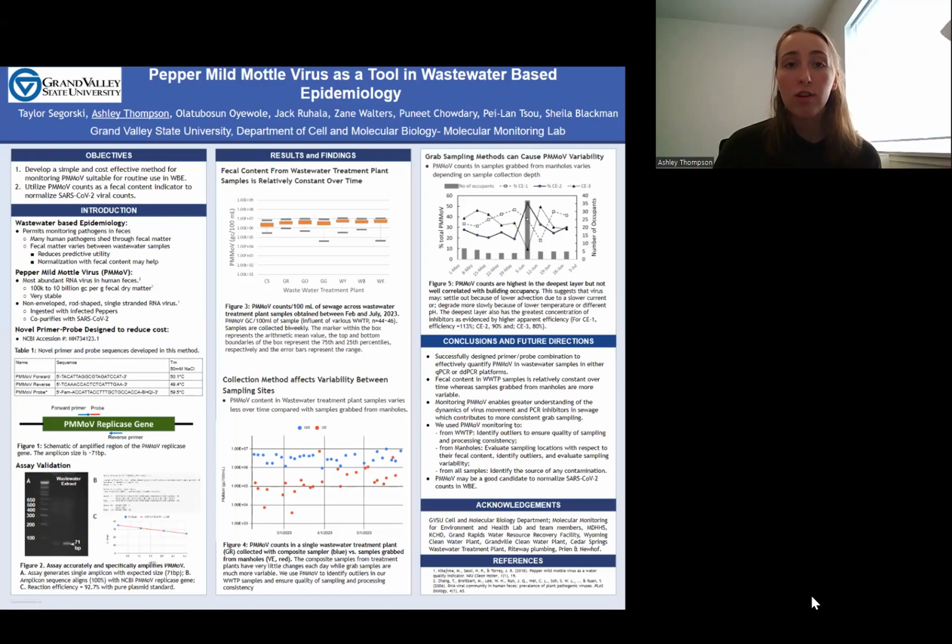Hello, my name is Ashley Thompson, and I'm with the Molecular Monitoring for Health and Environment Lab at Grand Valley State University. Our lab currently monitors wastewater for SARS-CoV-2 counts. However, within this, we are also looking at the pepper mild mottle virus as a tool in wastewater-based epidemiology.